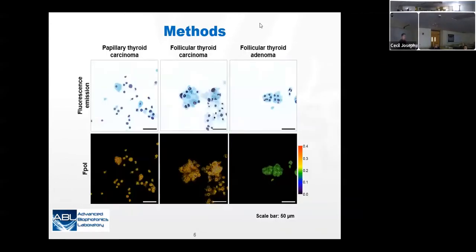One thing, the samples were all lysed to eliminate erythrocytes from the samples. And then indeed, that's correct. The fluorescence emission images provide this capability to analyze morphology, so when we were performing the analysis, you can usually look for cells that have a clearly defined nucleus, and you can select the thyroid epithelial cells for the analysis. Because our pathologists were as suspicious, even more suspicious than you are.